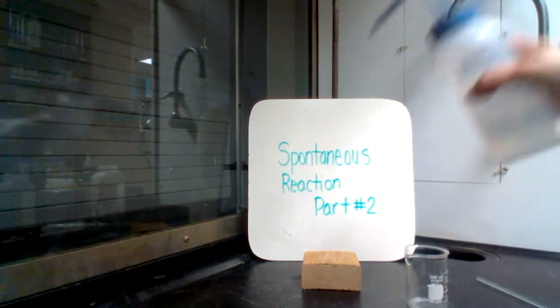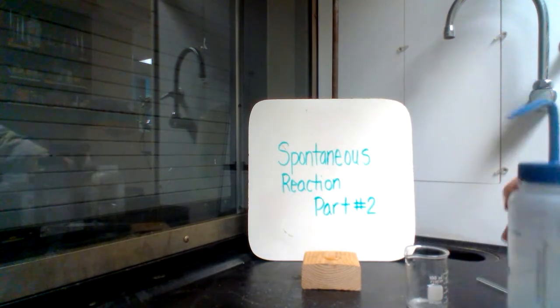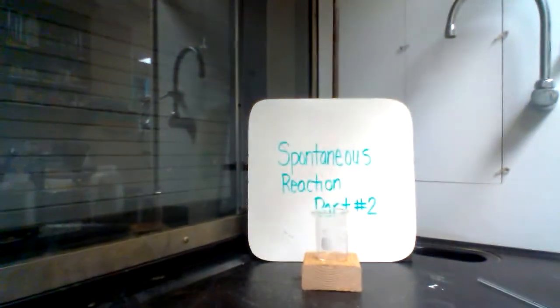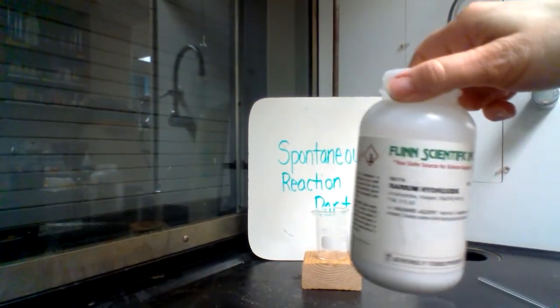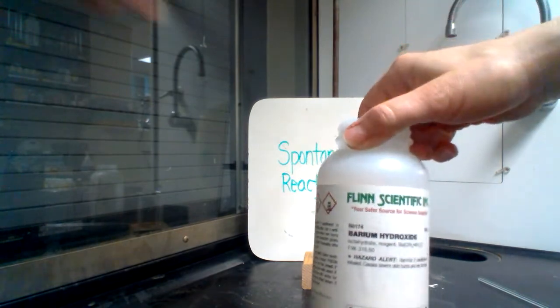Before I start the lab, however, I'm going to squirt some water on the wooden block where I will place my small beaker. I'm then going to take approximately 30 grams of each of the white solids.